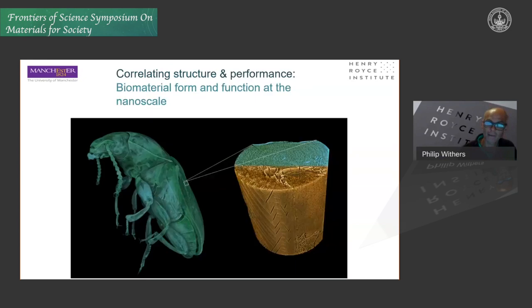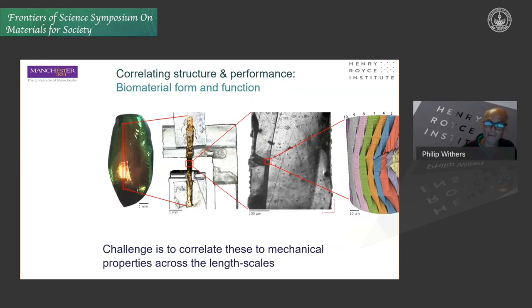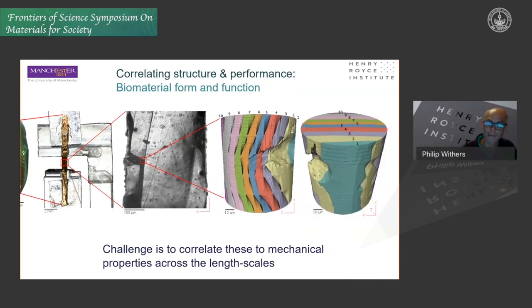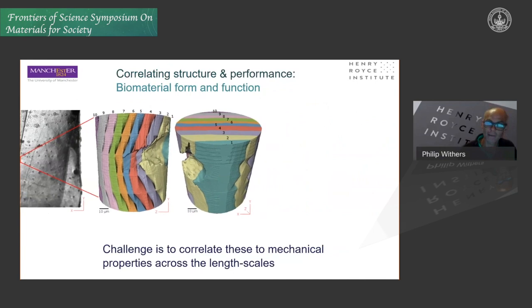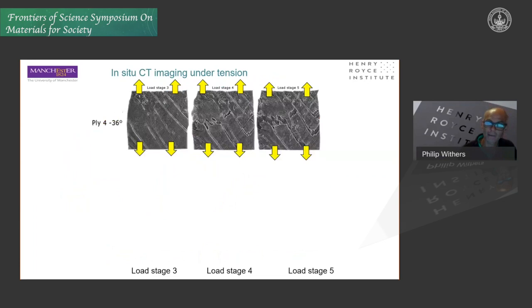And finally, one example of a composite from nature. I just wanted to show this at even higher resolution. So whereas our composites have scales where the fibers are of a few microns and the laminates maybe a few millimeters and the components maybe meters, the back of a beetle is a composite material and it performs in a very similar way. So again, we can make small samples and understand how that beetle material behaves under tension. So here we can see one ply of the material and no load, and we can see how cracks start to propagate as we increase the load, and those cracks ultimately open more widely.